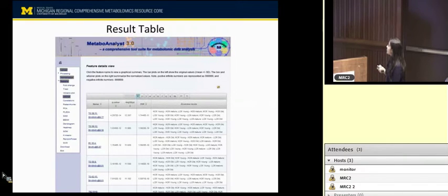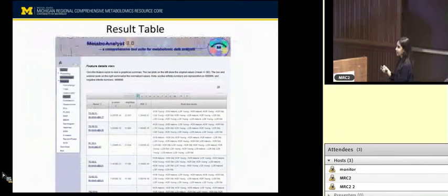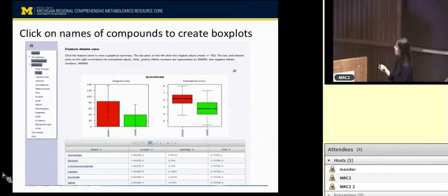And once you click on this, I think it gives you a box plot. Actually, I tried it this afternoon. I think there is a bug there, and I would let Jeff know to fix it. But this is what it looks like. So I used it with another data set that's already there in Metabolomics, and it works with that. It doesn't work with our data set. So okay, we'll check that before we get to the analysis tomorrow.